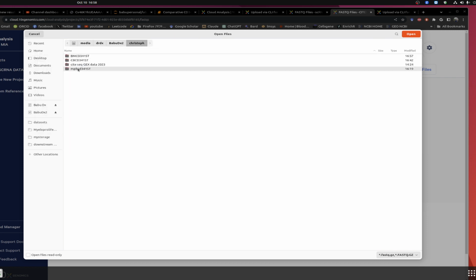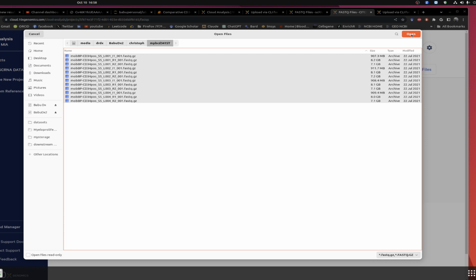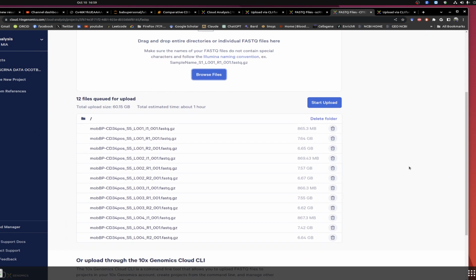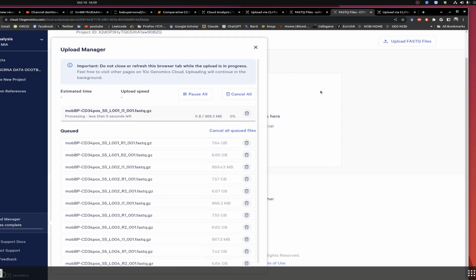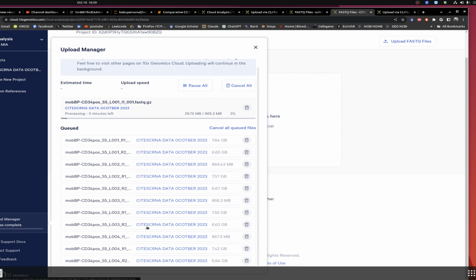So we want this entire folder to be uploaded. So select, click. Then the option comes, start uploading, and the upload will process. All the files will be uploaded one by one. This is as simple as that.